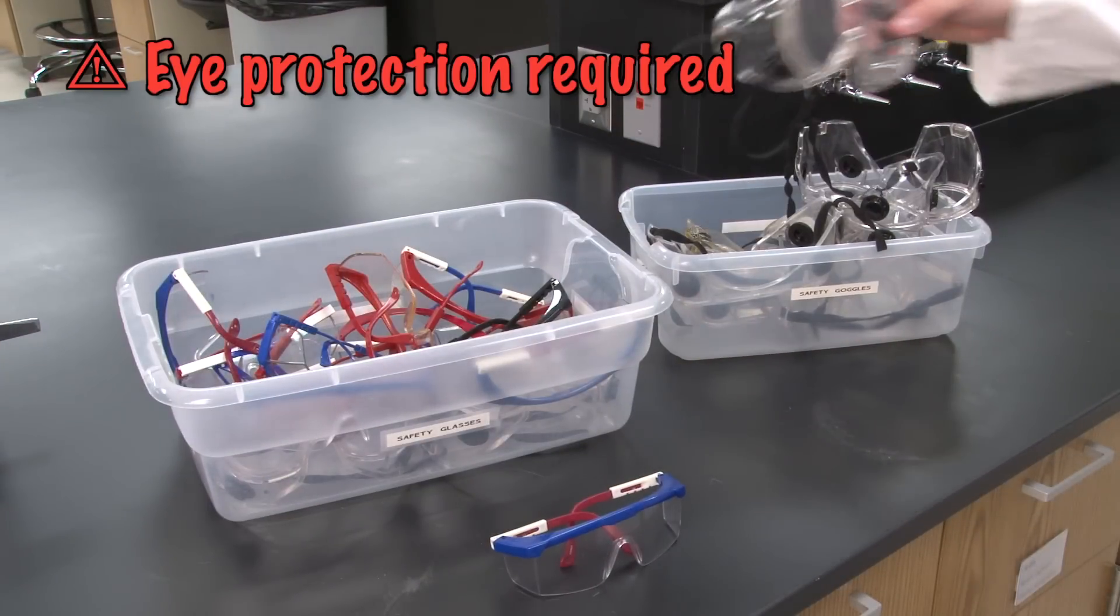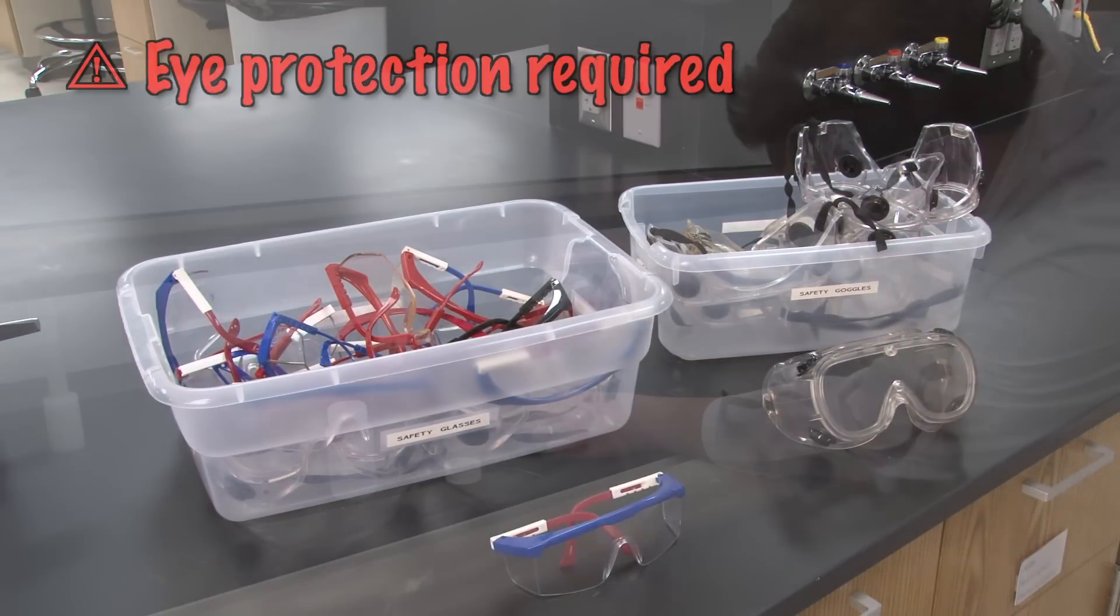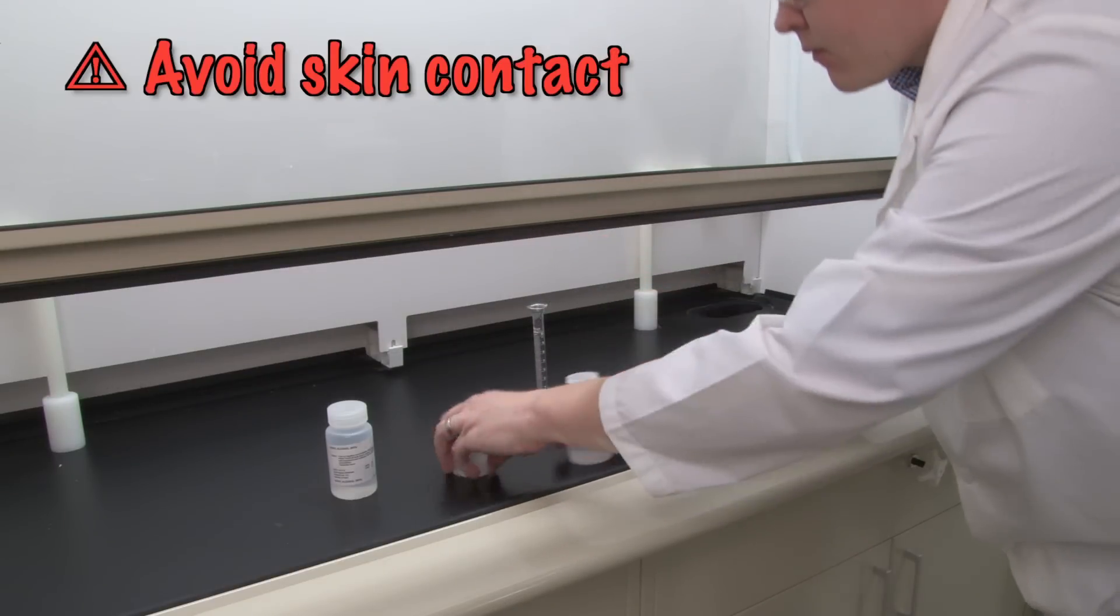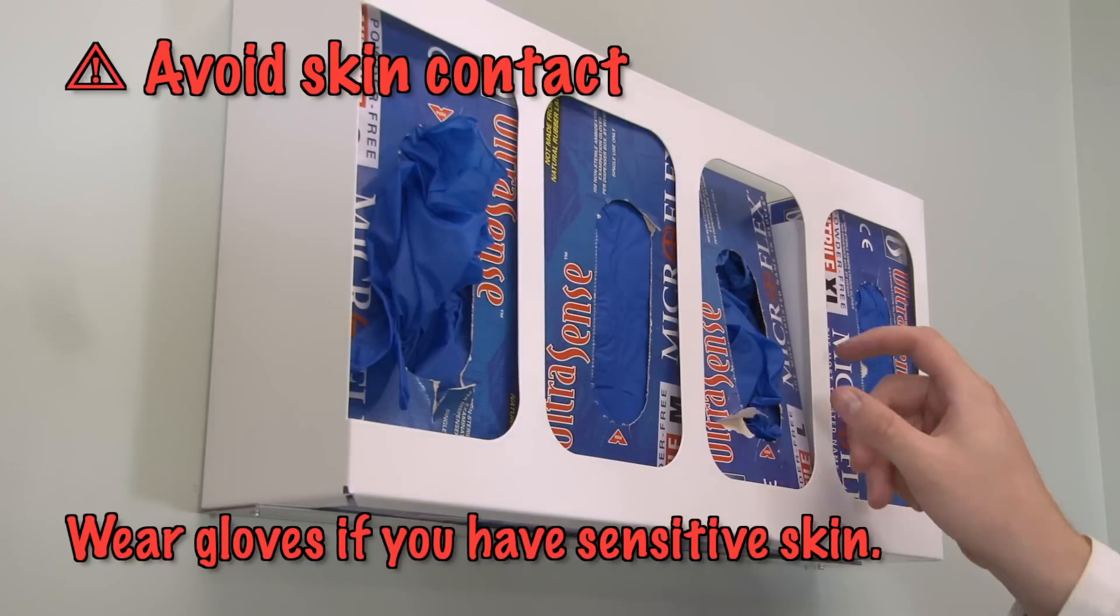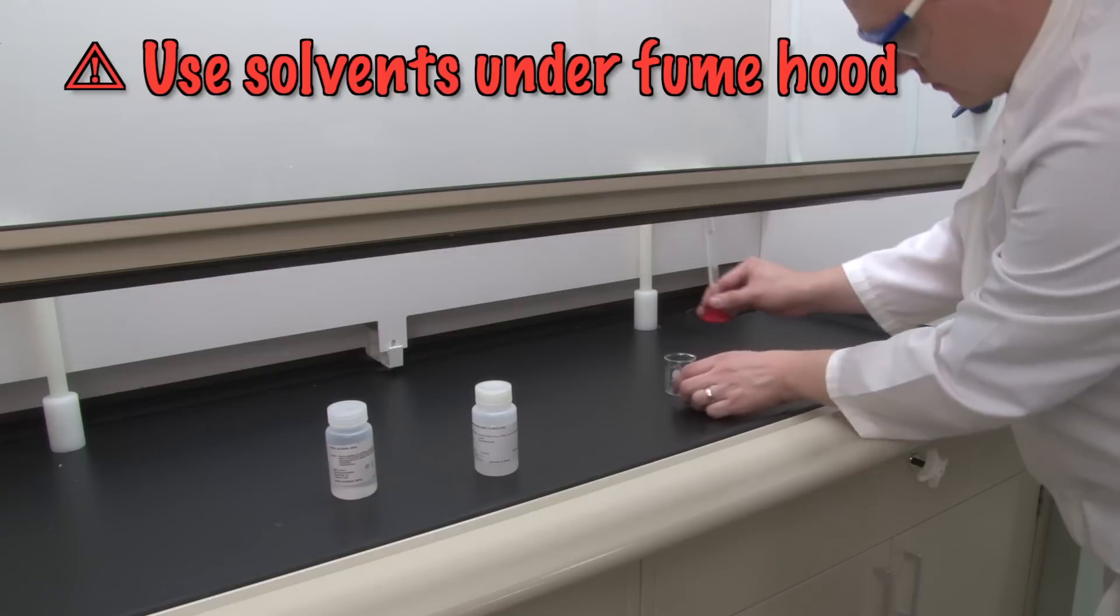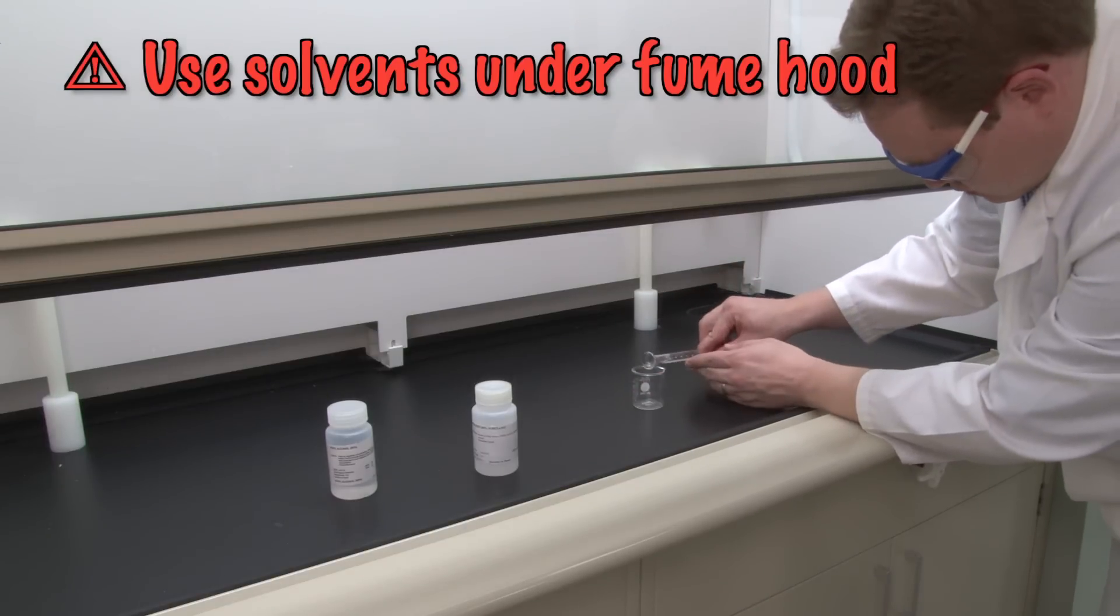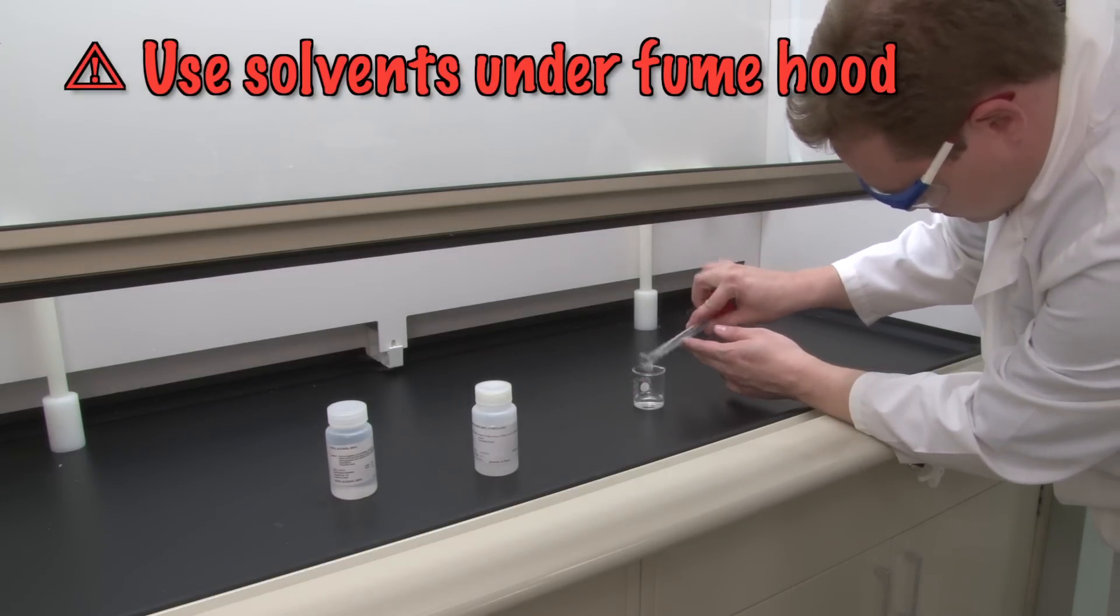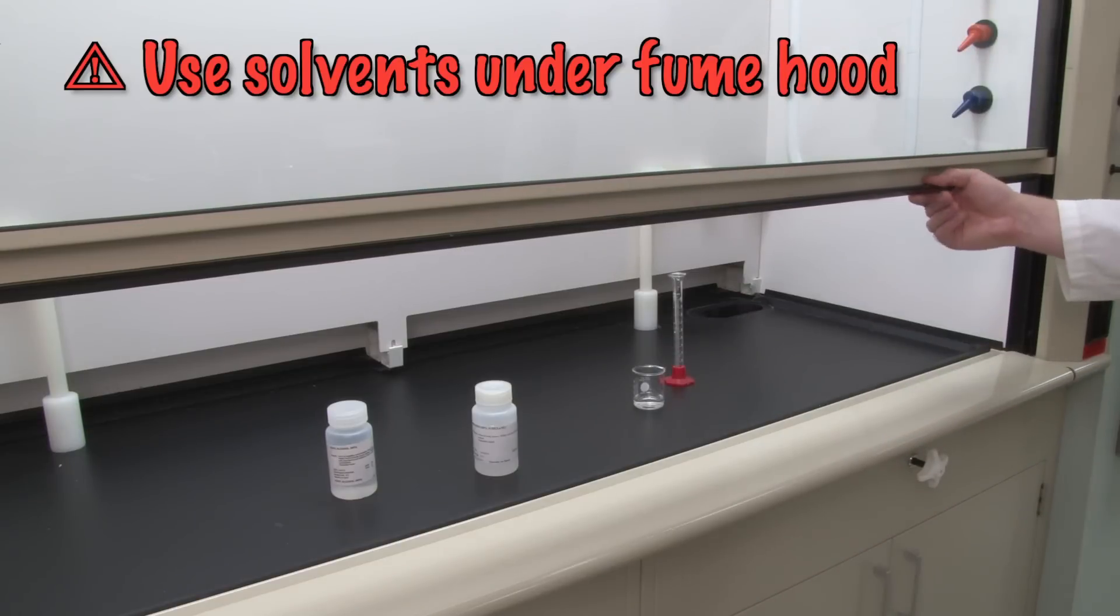Safety glasses or goggles must be worn for the entire experiment. The solvents we will use may dry or irritate your skin, so be careful when you're pouring them. You may want to wear gloves if you have sensitive skin. We also need to make sure that no solvent vapors get into our breathing air, so the solvents will only be used under the fume hoods. Make sure the hood sash is pushed back down whenever possible.